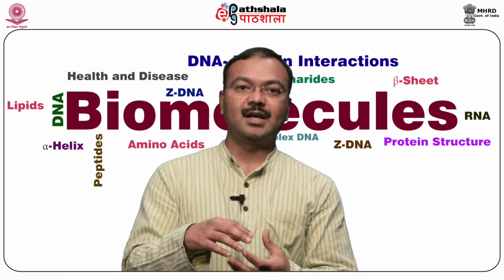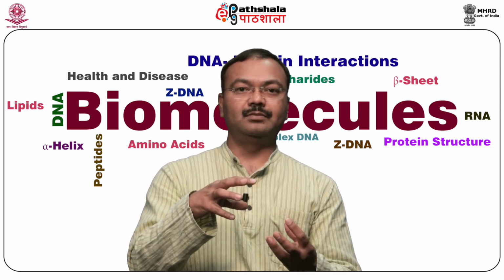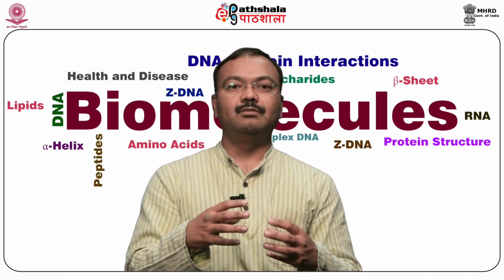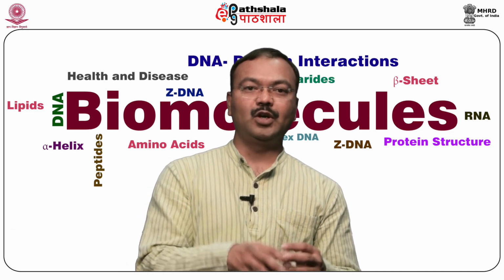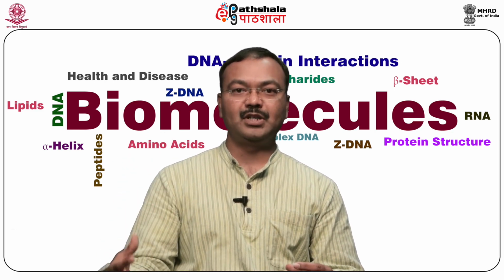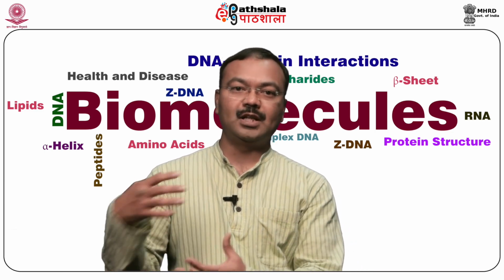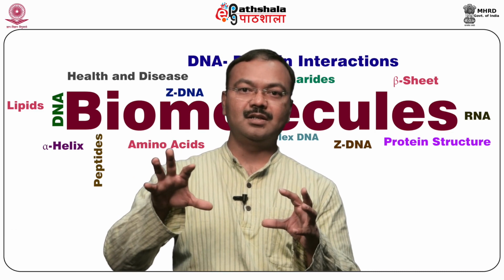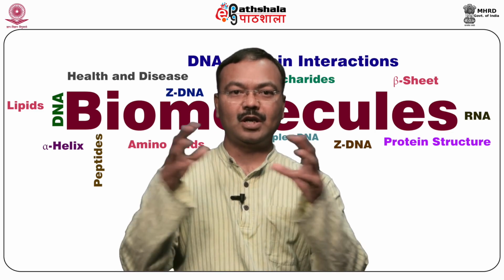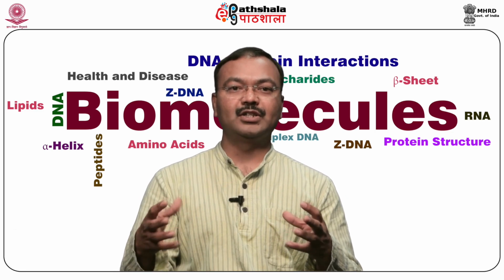With the crystal, you should understand the crystal packing and the space group, and once you have diffraction data and you understand the space group, you need to solve the phase problem, because from the spots you only get the intensity or structure factor, but phase information is lost. That means you need to solve the structure. Once you solve the structure and you fit the model into the electron density, you have to refine and optimize the structure. And once you have the structure, you validate it and understand the biology or function of the protein molecule.